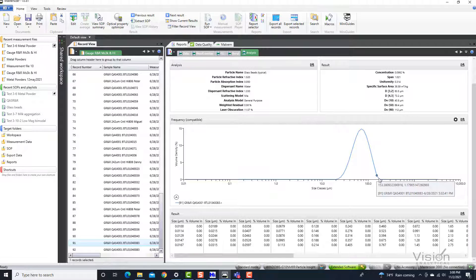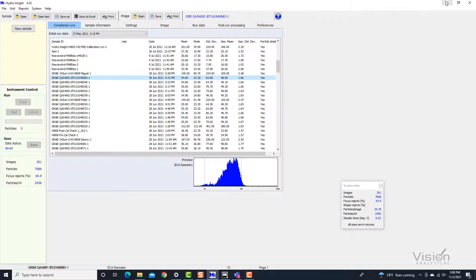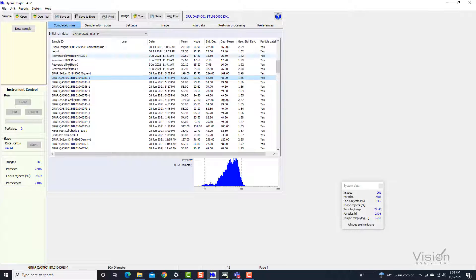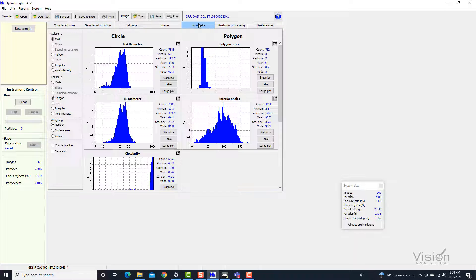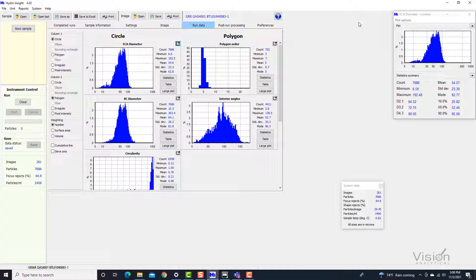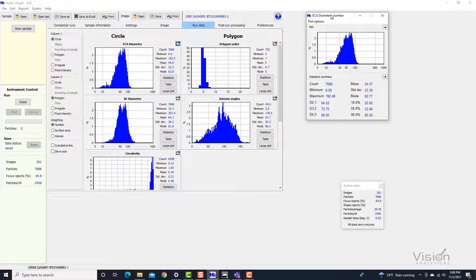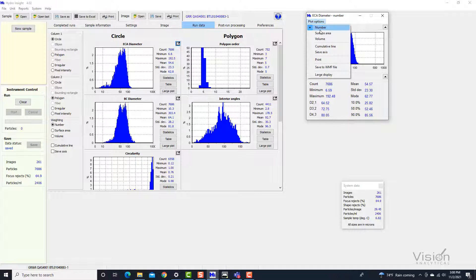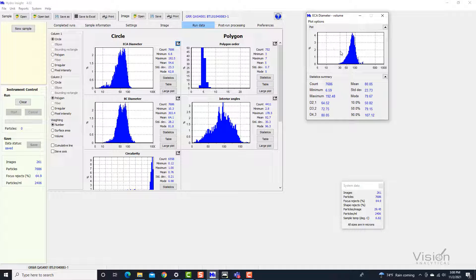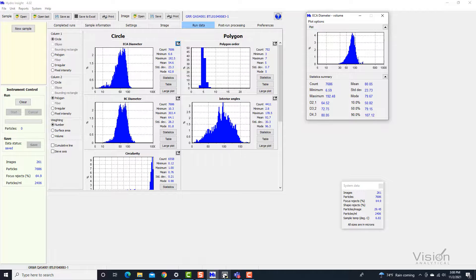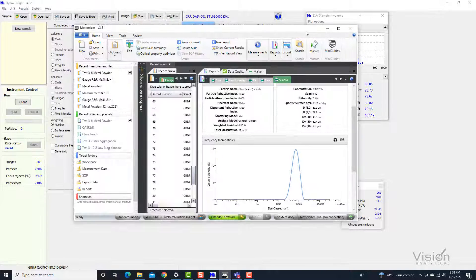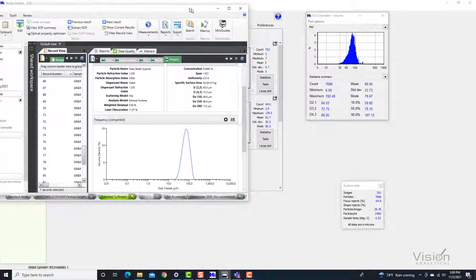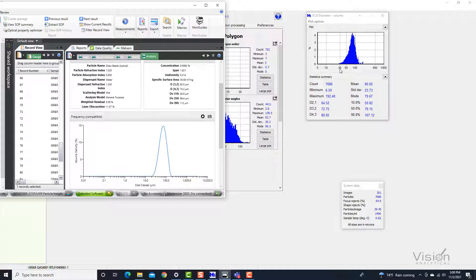Because this was done in tandem with the Hydro Insight at the same time that we were doing this analysis on the Masterciser 3000, we also have this sample, 83. It was actually done at the same time. When we look at the Hydro Insight information, we look at normally a number-based distribution because this is a number-based instrument. But if we look at a volume-based distribution, you see a lot of similarities between the data from the Masterciser and the Hydro Insight.